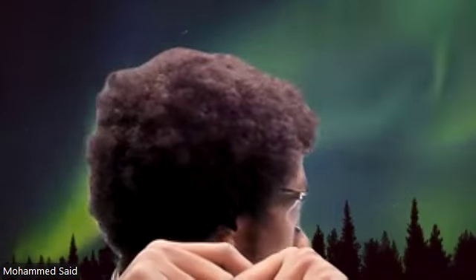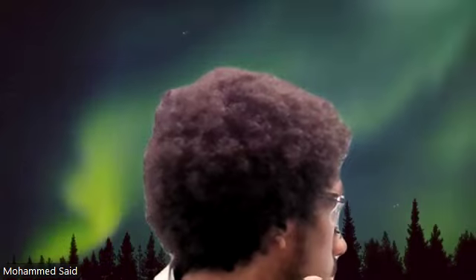For slide 7, not necessarily, no. The reason is that these are finite time points and the UV exposure is different. That's why I want you to think about the different methods you did. Did I mask, unmask? Did I tilt or turn over my plate accordingly? Did I cover with a lid? They have important functions, right? But you want to be able to describe those details clearly for your FLRs.